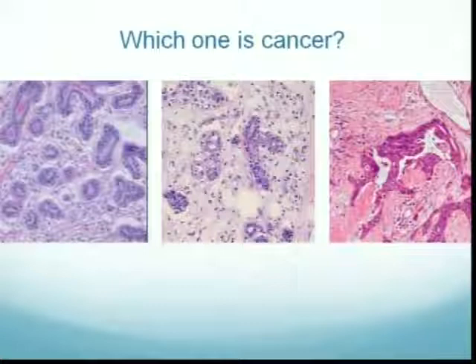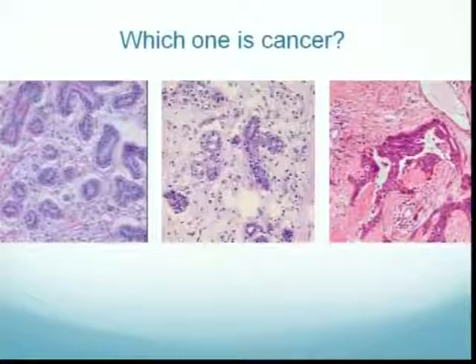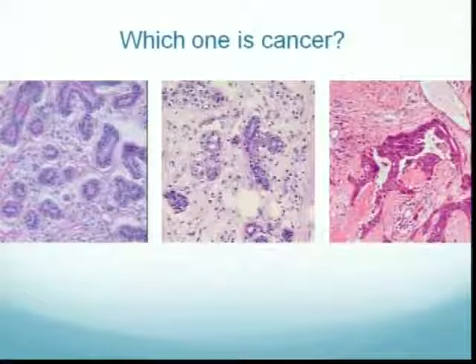Now, you can get a gold star if you answer this next question. Yun Long will buy you a cup of coffee. Yeah, that's right. What would be wrong with using this cancer in an RNA-seq study?